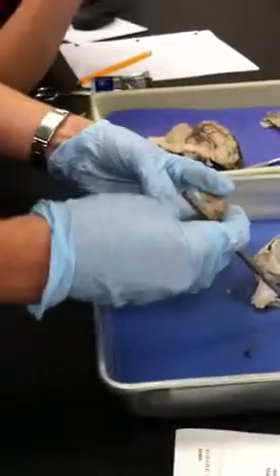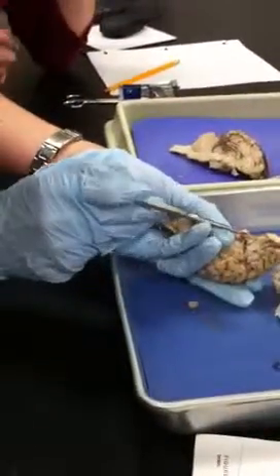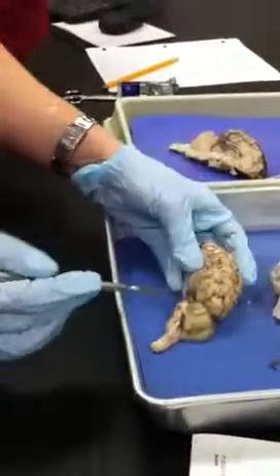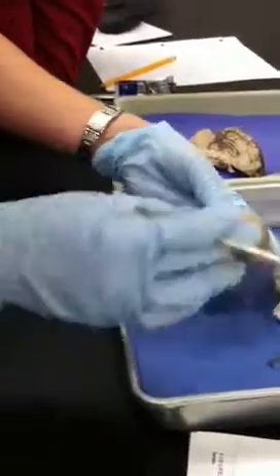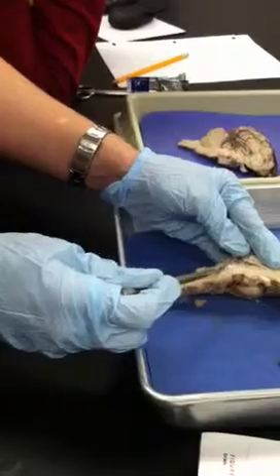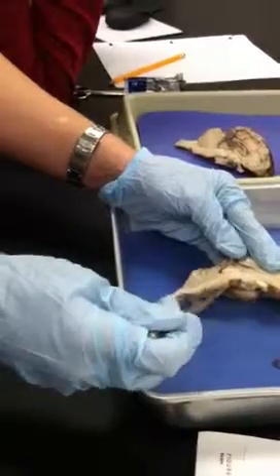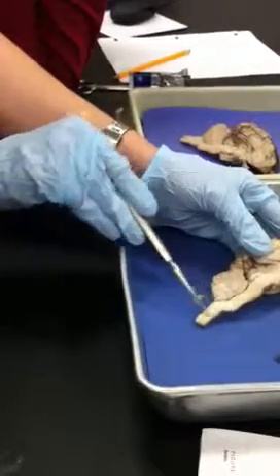So in this lab practical, are you going to just have it pinned and say what is this? Yep, absolutely. Optic nerve, optic chiasm, optic tract. Lobes are kind of hard to see on the sheep, so I'm not going to ask you too much, but if it's obvious, occipital, temporal, parietal, frontal, cerebellum, obviously. Regions of the brainstem, so where the colliculi are, superior and inferior colliculi, that is the midbrain. The pons is this region here, where you have the cerebellum and the pons on that side, and then the medulla oblongata.